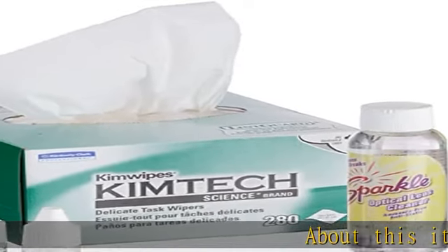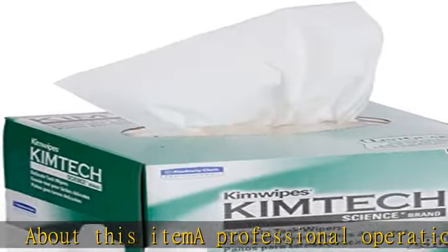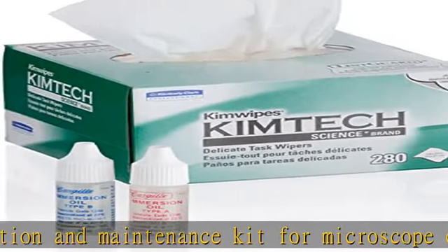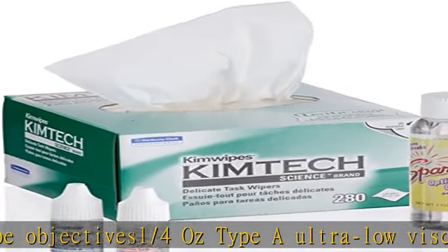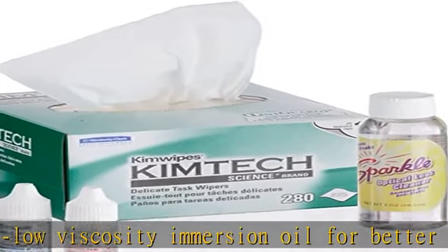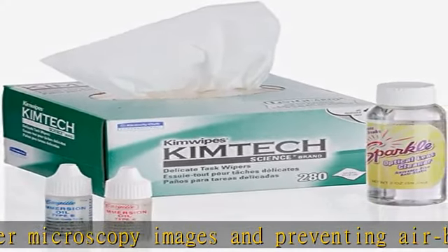About this item: a professional operation and maintenance kit for microscope objectives. Includes 1/4 oz Type A ultra low viscosity immersion oil for better microscopy images and preventing air bubble formation, 1/4 oz Type B medium viscosity immersion oil for better microscopy images and prolonged use, optical lens cleaner especially great for cleaning immersion oil from objectives, and soft anti-static anti-lint Kim Wipes. Check the description to get this product today at the best price.